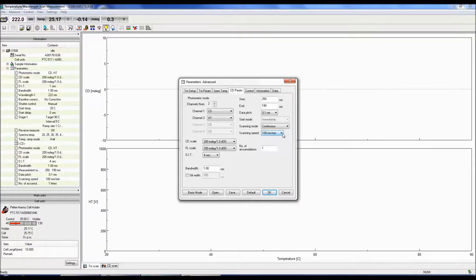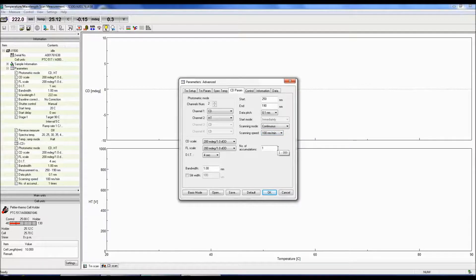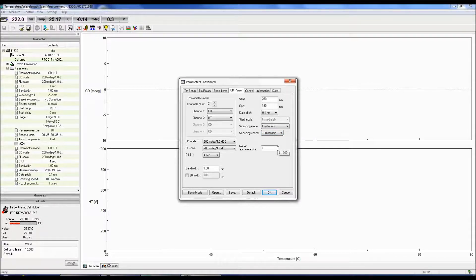The accumulations are the number of spectrum obtained and averaged together. The more accumulations, the better the signal-to-noise of your spectrum.